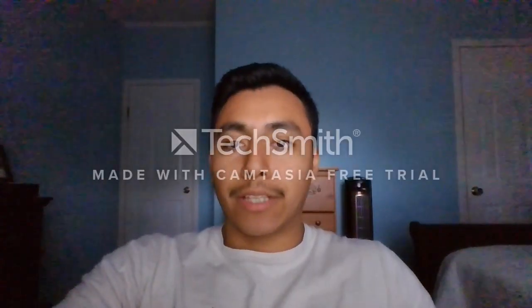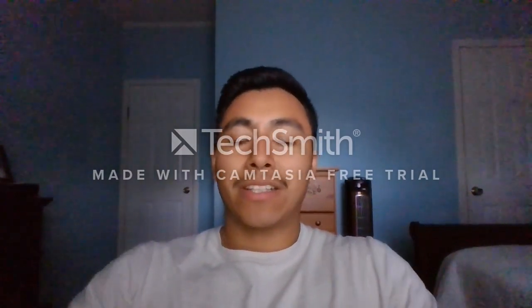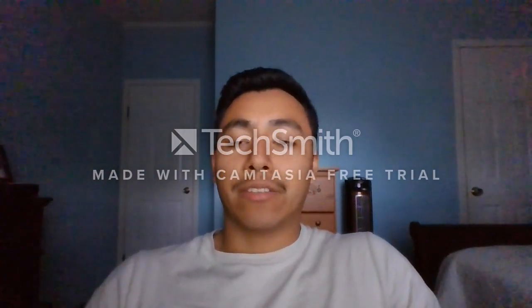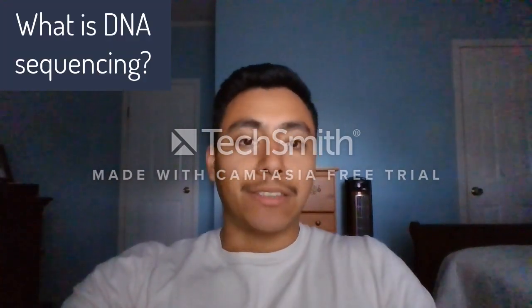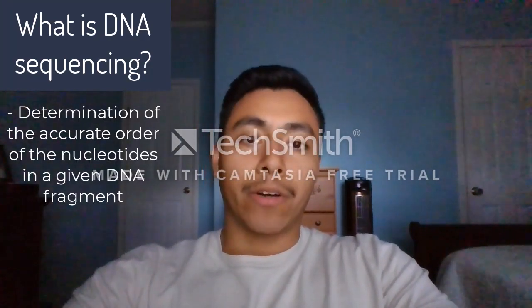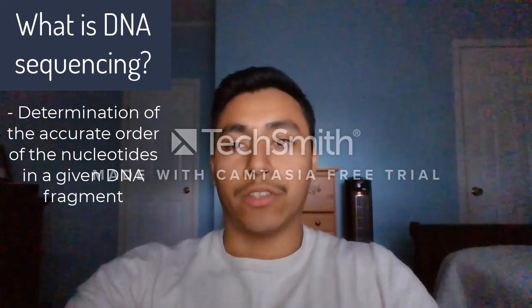So, stepping away from the graphs, I'll now show you an overview of DNA sequencing and how we used it in our experiments. Specifically, what we amplified and sequenced, spoiler, ITS and 16S, and why ITS and 16S sequencing is used. So, what is DNA sequencing? DNA sequencing is a determination of the accurate order of the nucleotides in a given DNA fragment. This is incredibly important in identifying the structure and function of the genes.